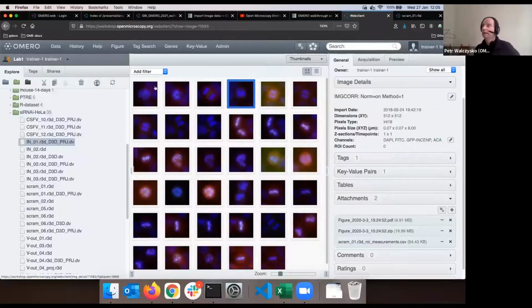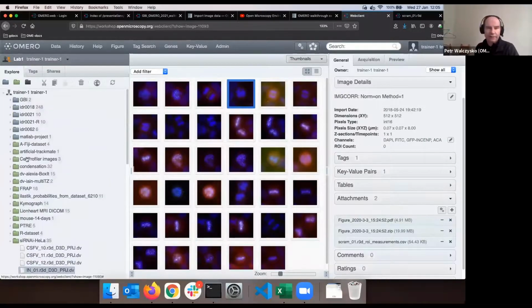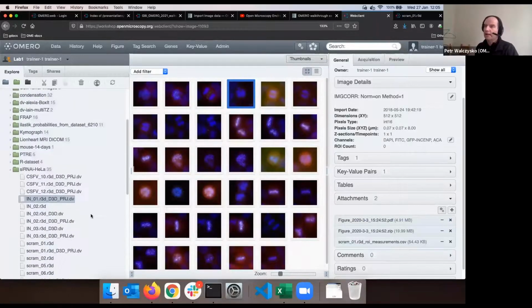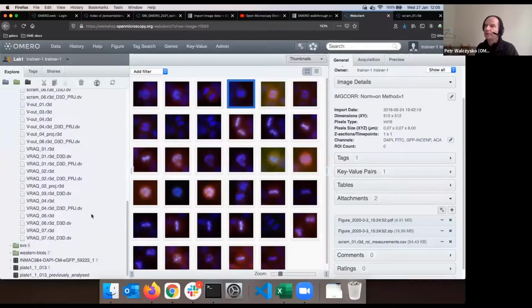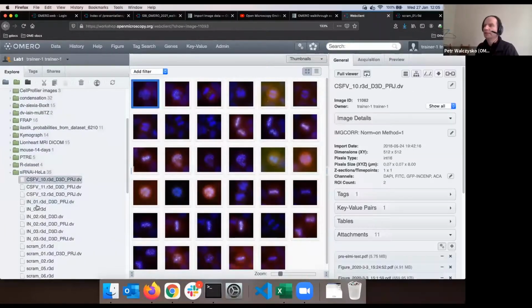And let's now quickly go to show you OMERO figure. Okay. So once you have prepared your ground like this, you would like to annotate and analyze. We will do the analysis after the lunch. Okay. Once you have your analysis, you would like to publish.